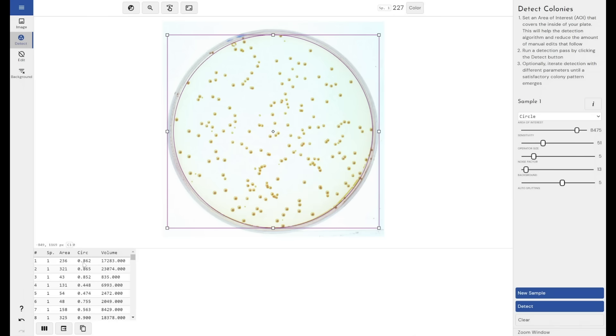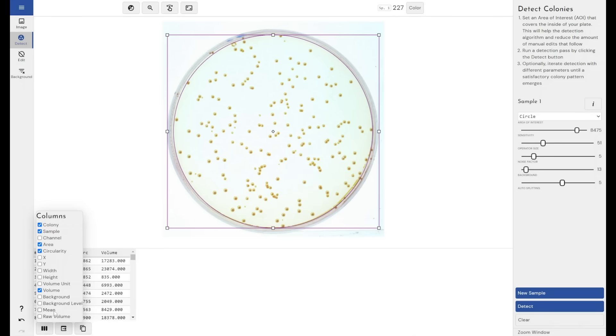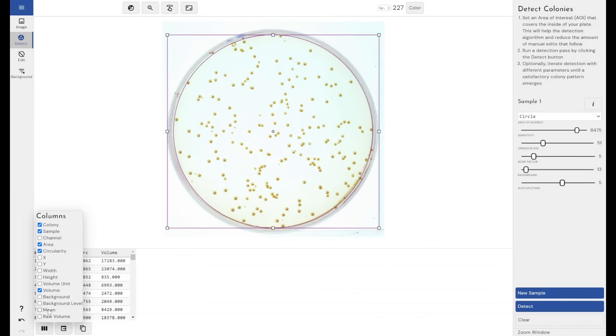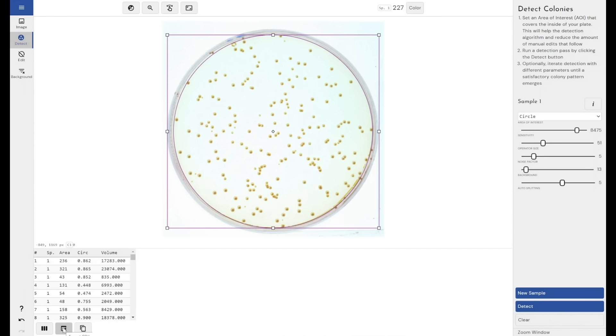We get an area measurement, a circularity measurement, and a volume measurement. We've also got other measurements that we can build into our results. As with our other image analysis software, we can export this to a CSV file to move it into Excel and then do other things with it in other pieces of software.